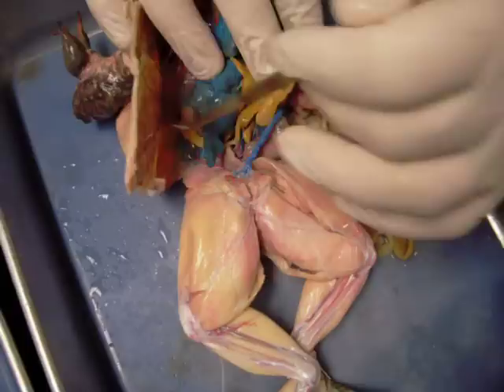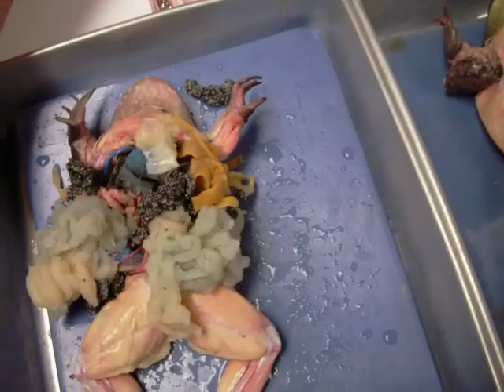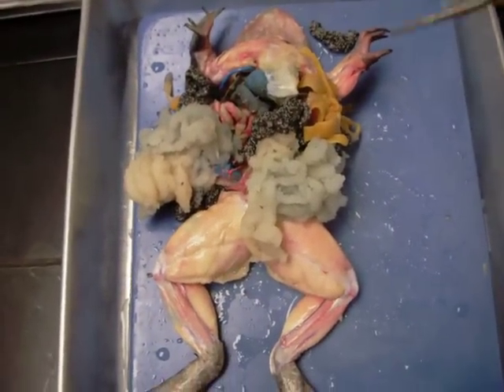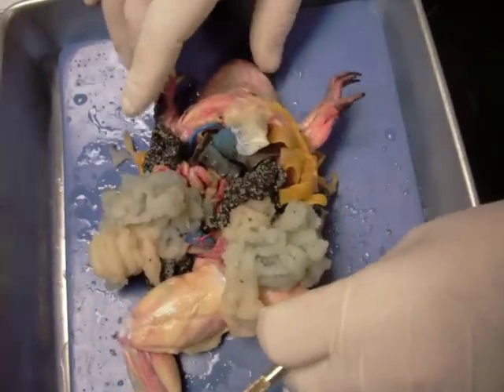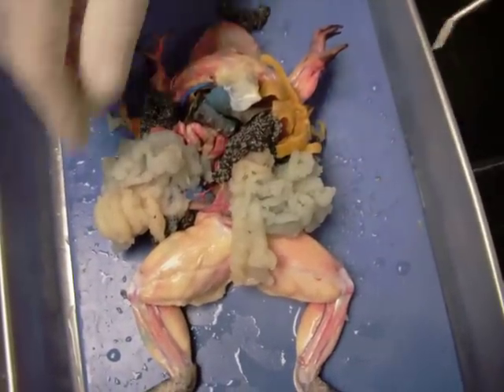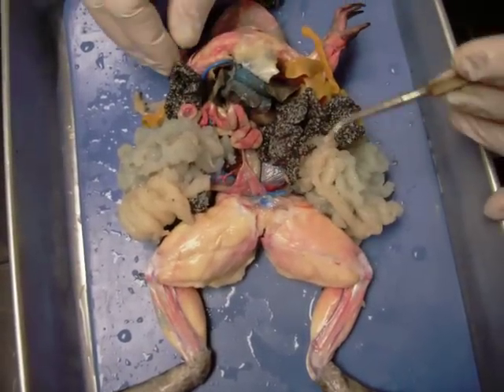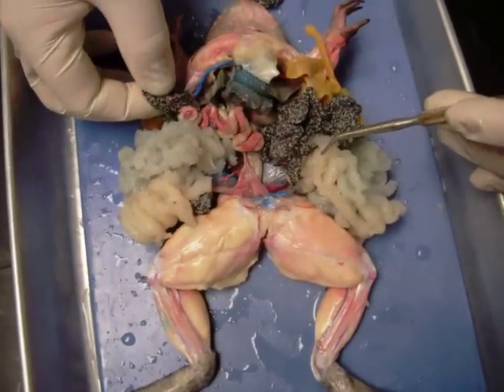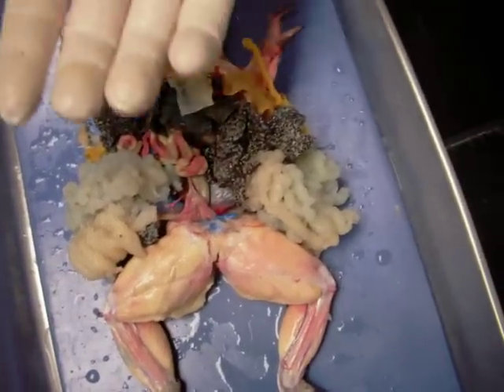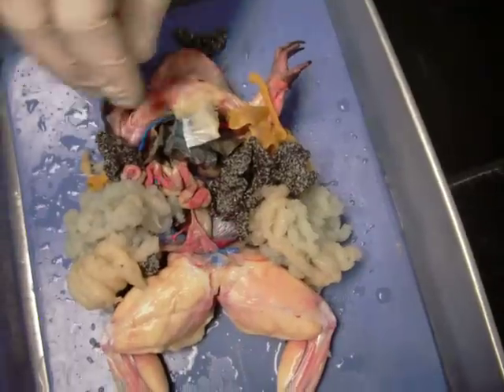We'll continue this dissection with the female. Here's the female frog. One of the most obvious structures we see on this frog are the oviducts — lots and lots of oviducts. That's where the eggs mature and receive their nutrients. And then these salt-and-pepper structures here are the ovaries. If you take a look, you can usually isolate a single frog egg — each one of these little specks is a frog egg.